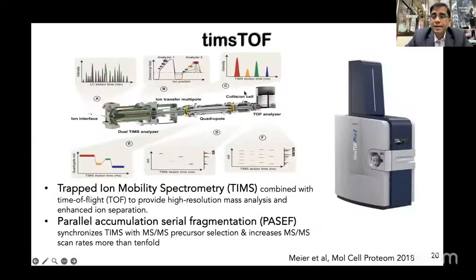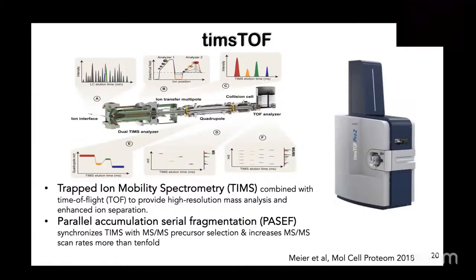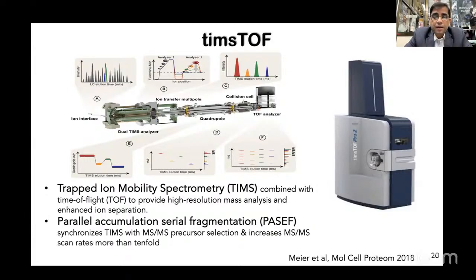And then more recently, coming from Bruker, the timsTOF, which is another revolutionary technology, which looks into a 4th dimension of separation. The idea is, in addition to mass, charge, intensity, and retention time, can we also look at ion mobility as a 4th-dimension separation? So this is one of the very revolutionary technologies available, which utilizes PASEF, parallel accumulation serial fragmentation, to select your precursors and increase your MSMS scan rate.